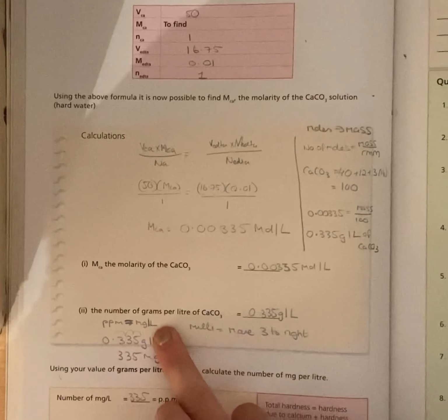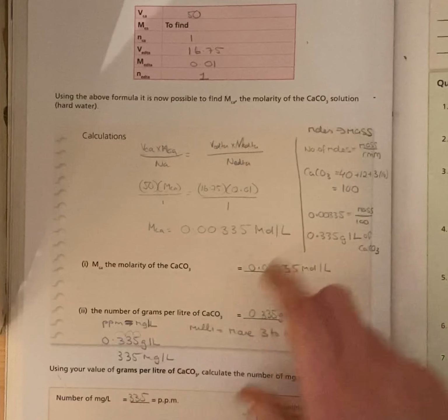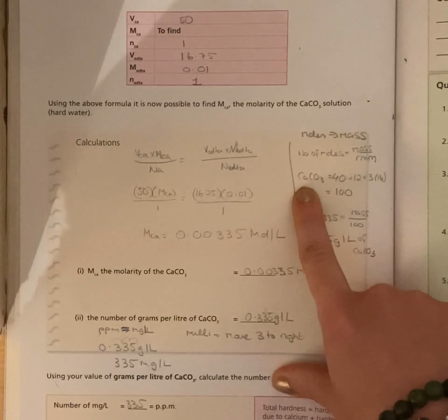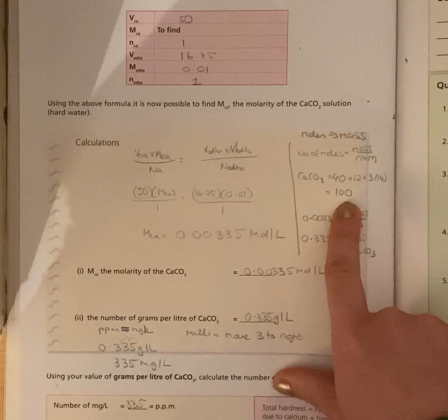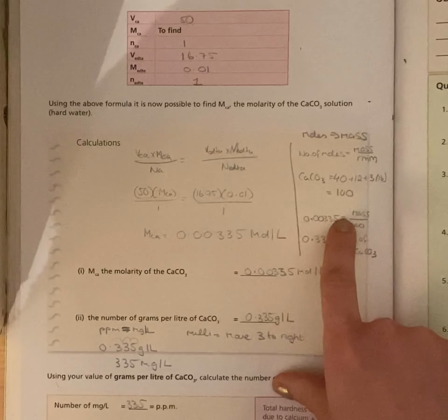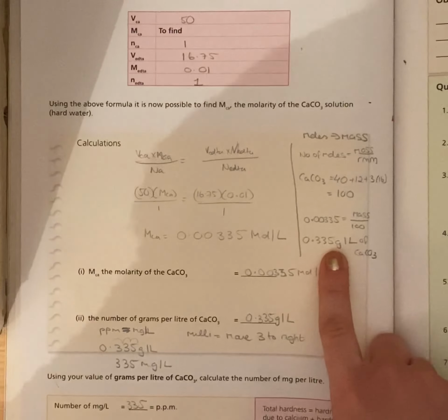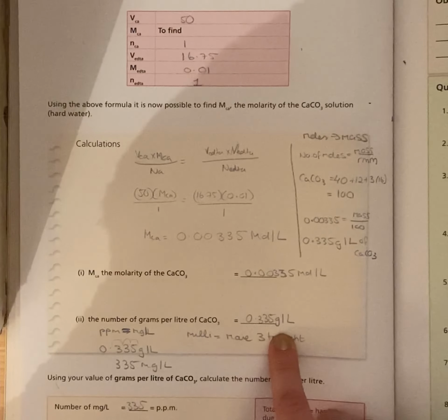Now we need to convert that moles per litre into grams per litre. So to do that, we're going to use our formula. Number of moles equals mass over relative molecular mass. So the relative molecular mass of calcium carbonate is 40 plus 12 plus 3 times 16, which is 100. Put in whatever moles you got here, equals mass over 100. Multiply the 100 by your molarity, and you'll convert it into grams per litre. So I got 0.335 grams per litre.